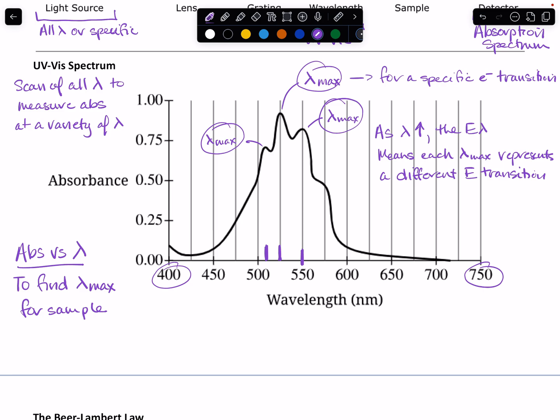As I mentioned before, iron has a very specific lambda max when it is present as part of a heme inside of a protein, as do cobalt, molybdenum, chromium. They all have different lambda max values because their atoms are different. They have different protons, they have different electrons, and depending on their bonding environment, things are different. So you can use those as a way to identify the lambda max, which in turn can help identify atoms within.